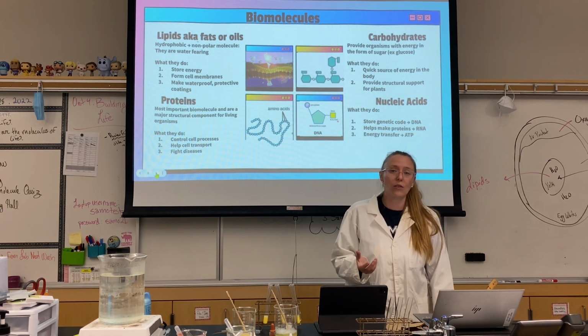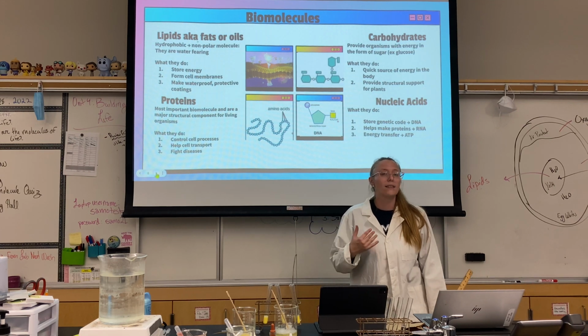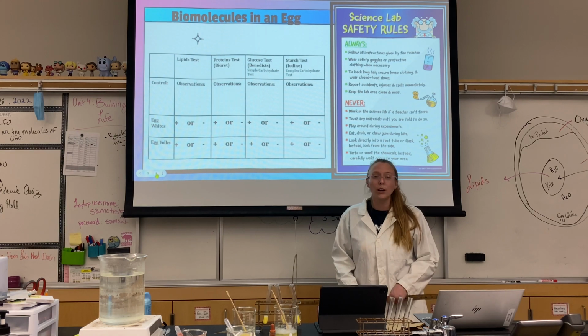We're going to be looking to see where the proteins, the carbohydrates, simple and complex, as well as lipids are. So follow along with me. First, we're going to do a control.